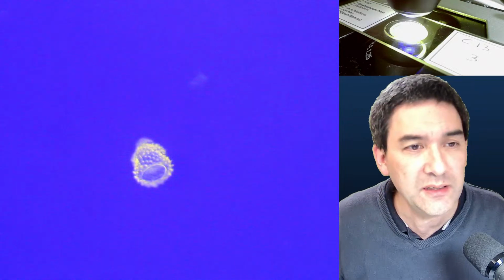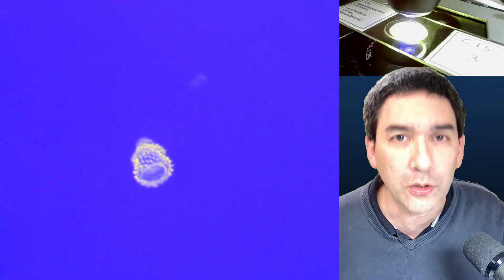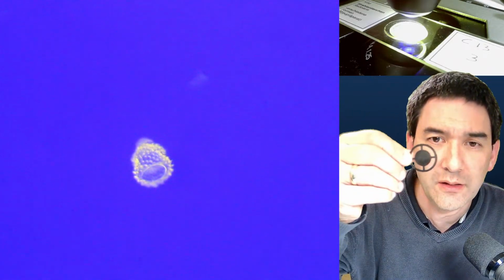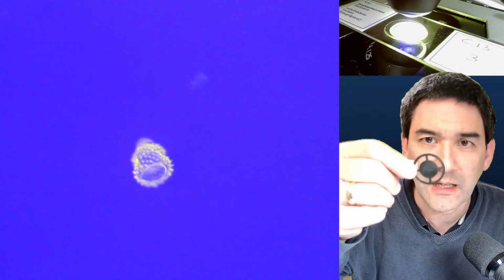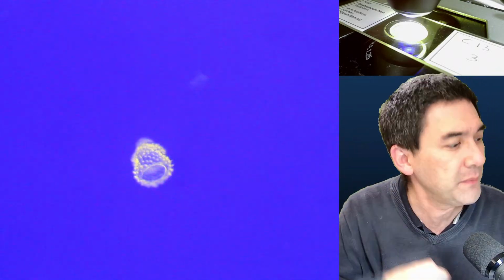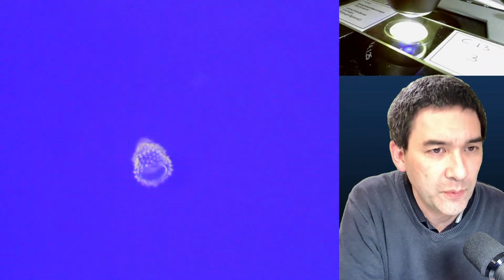Now this technique is of course very related to dark field. So this is a dark field ring. Basically it completely makes it black, like black and white, so to say. And I will just show you how it looks with dark field, the highly related technique here. If you do it with dark field like this, it's also okay, but sometimes I think the contrast is a little bit too high.